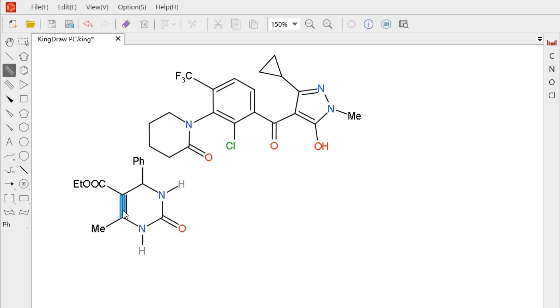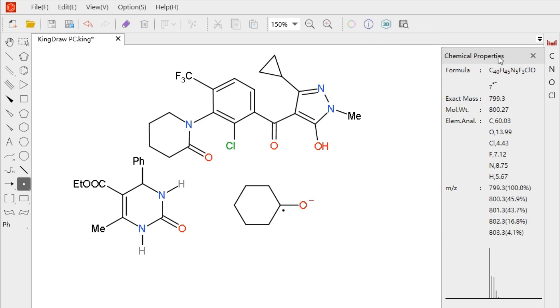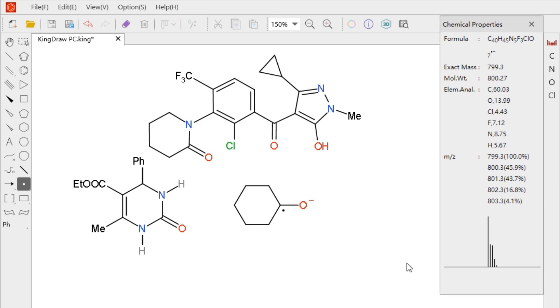When there are multiple structures on the canvas, we do not perform any operations and directly click chemical properties. And all structure properties are displayed in the window.